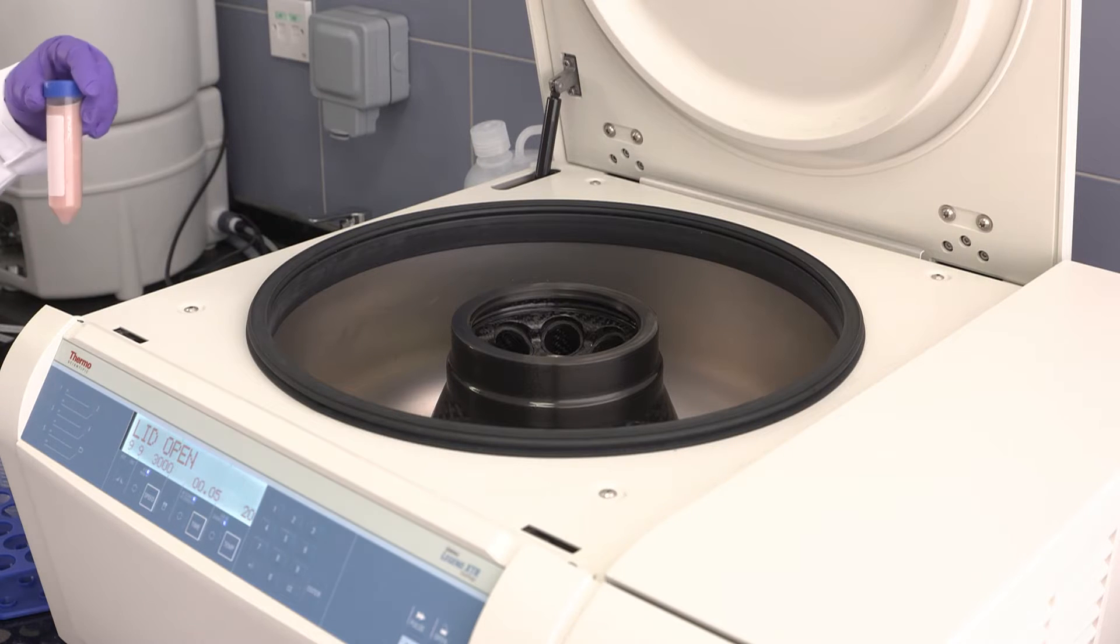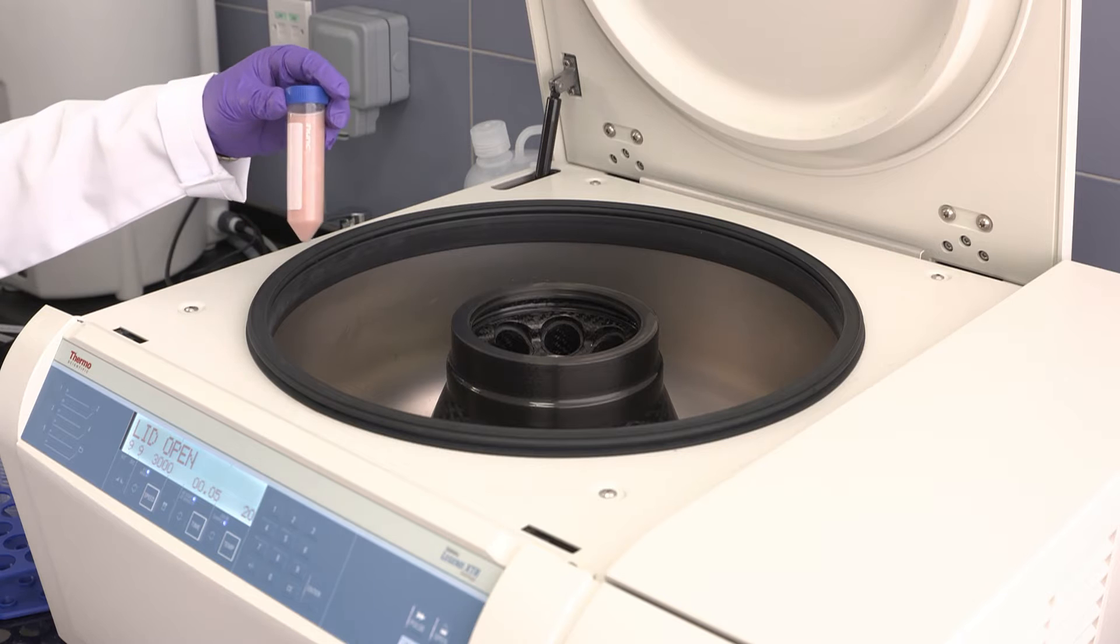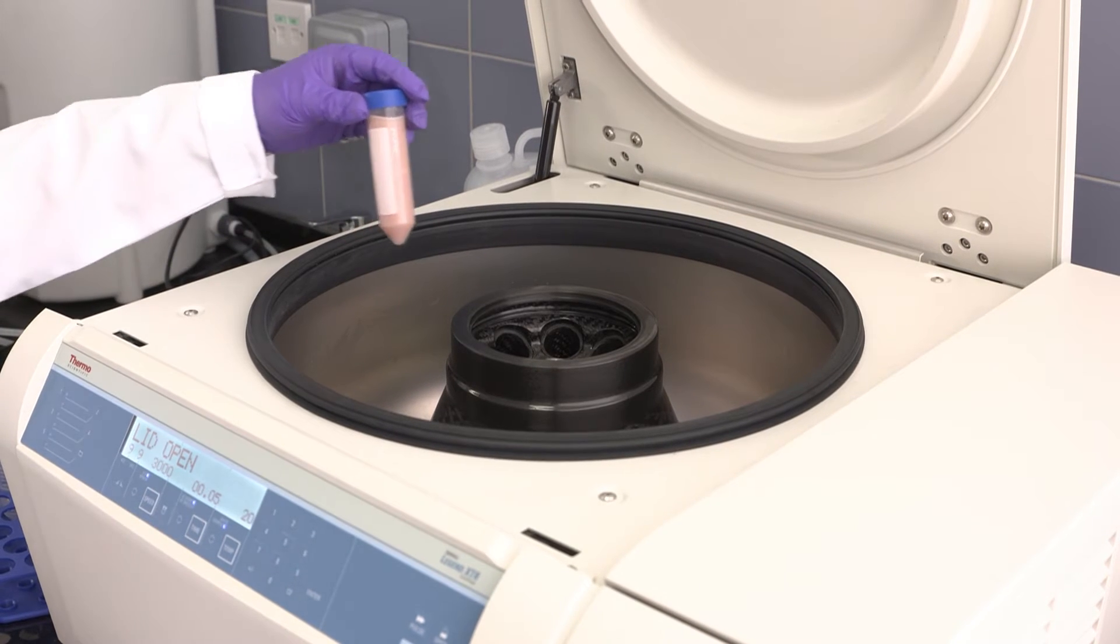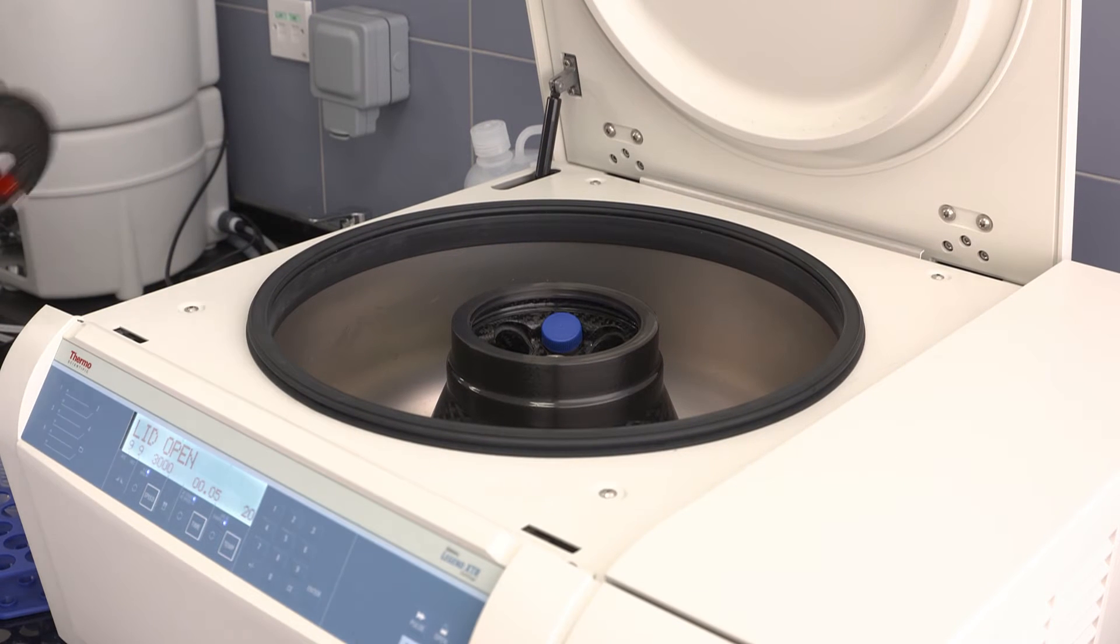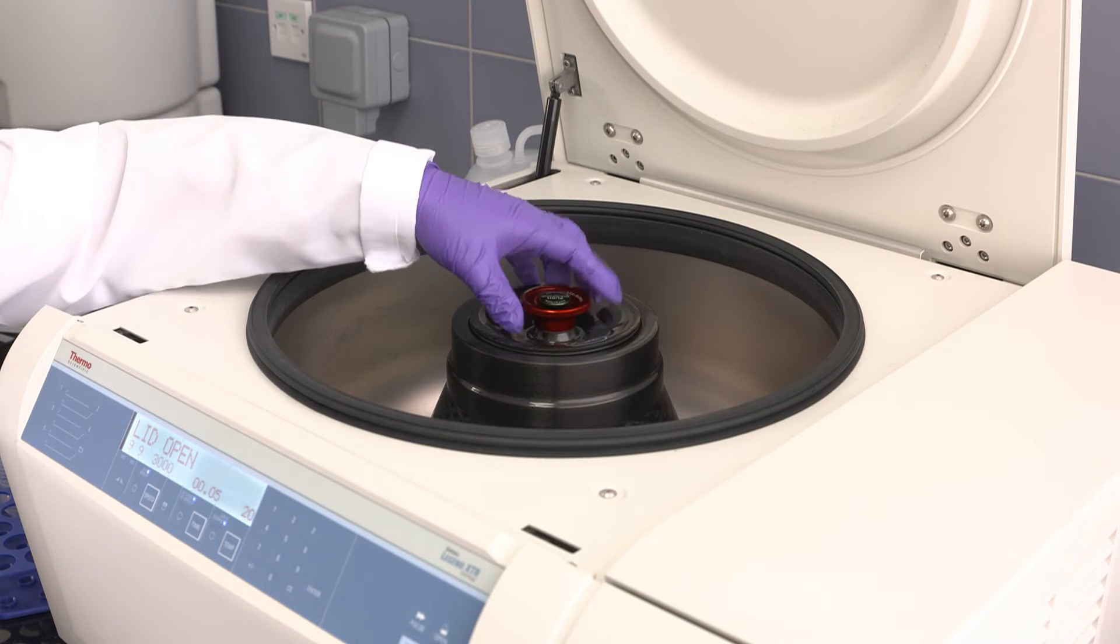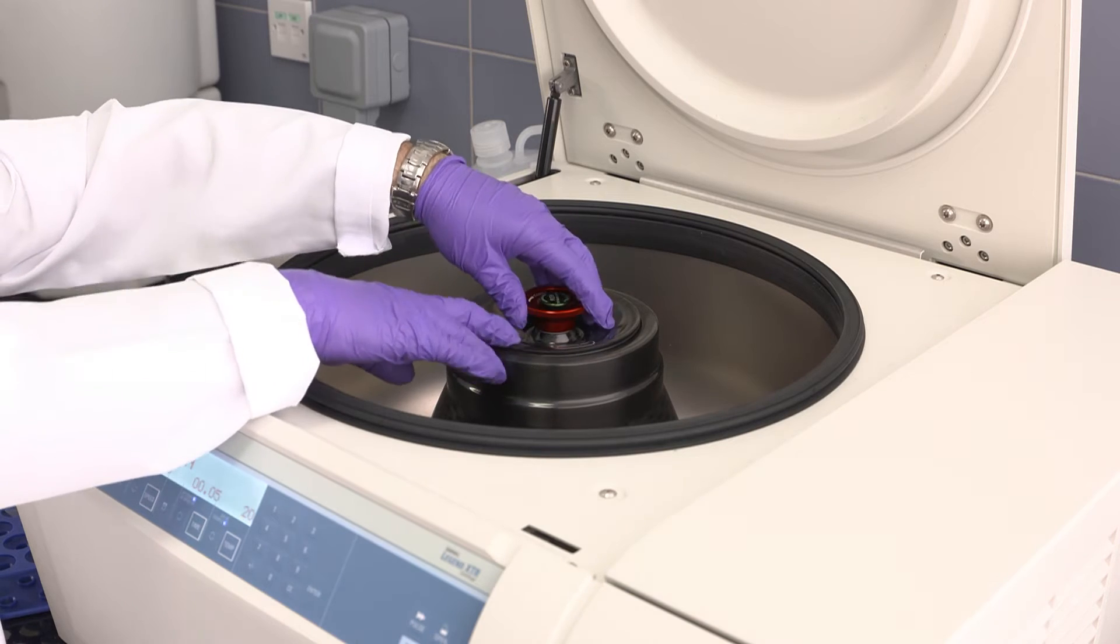We will centrifuge the mixture at 3000 g for 5 minutes. The debris will accumulate at the bottom and the side of the tube and we'll be able to use the supernatant and extract the protein.